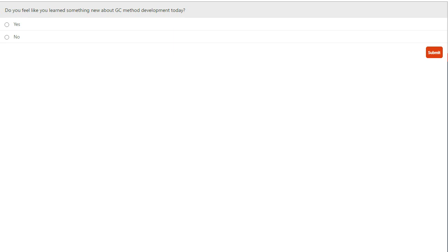That helps. Okay. Can you please repeat why you would not need a hold time for temperature when using the split mode?